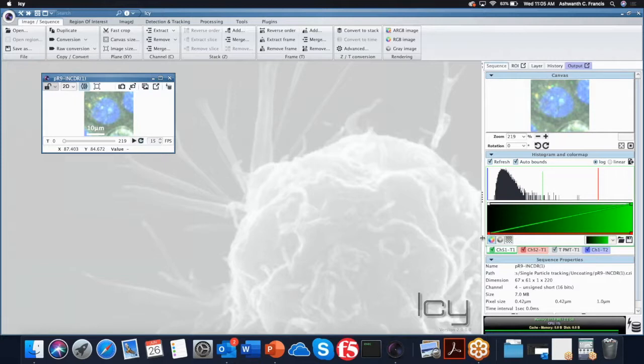You get 4 channels on the image. Do you see 4 channels? These 4: green, red, white, and blue. Okay. So now you can actually turn off the PMT channel because it's probably not useful. And like I said, the channel that we are going to track in these is the green channel, the first channel that you're looking at.